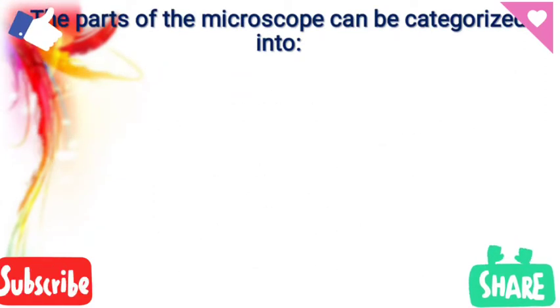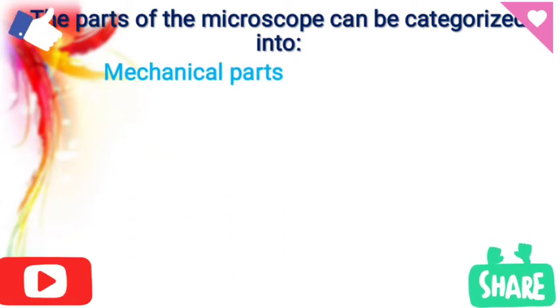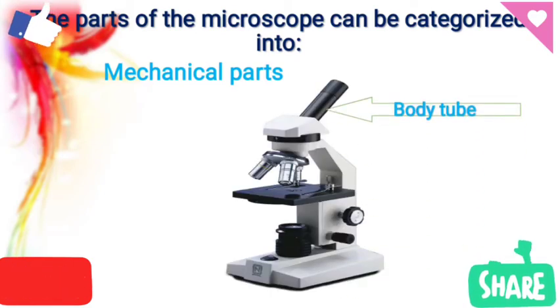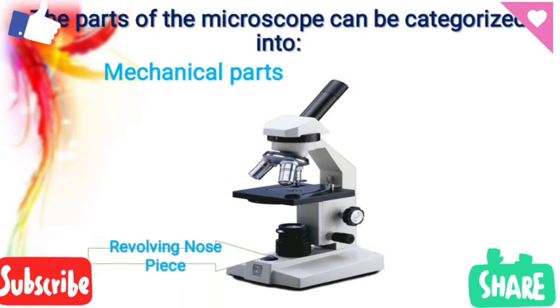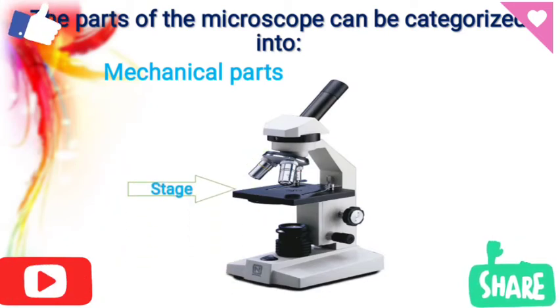Then the parts of the microscope can be categorized into two parts: mechanical and optical. Let's see the mechanical parts of the microscope. This is the body tube of the microscope. Arm of the microscope. Revolving nose piece. Stage clips.